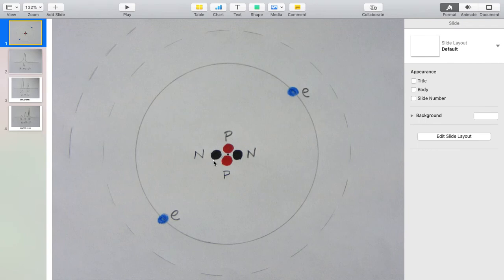That's explained a little bit about chemistry. I'll just explain briefly that the way mass spectrometers work is simply by applying Newton's laws to the movement of atoms and molecules. You can see from what we've said that the internal workings of atoms is very much tied up with things way beyond Newton's laws, with quantum mechanics and all sorts of things that are difficult to understand. But the way atoms and molecules behave when they are accelerated by forces can be explained quite adequately by Newton's laws, and really this is all mass spectrometers do.